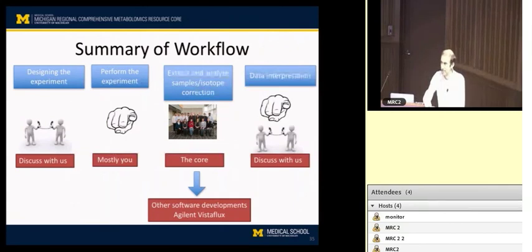Is what you explained just for a targeted analysis, or for untargeted analysis as well? Great question. I would recommend, if you're getting started in fluxomics, you think of it primarily as a targeted workflow. It is much less complex.